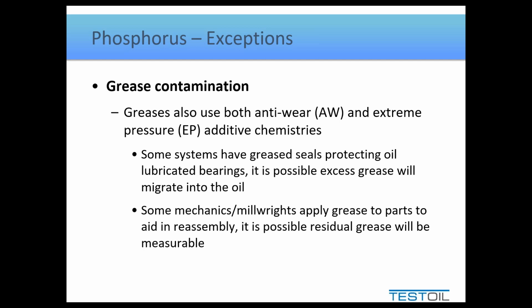Another time, though, is sometimes during assembly, whether that's from original assembly or a rebuild, that the mechanic or the millwright might apply grease to some of the parts to either help hold them in place or lubricate them on their way in. And again, that may wash off and end up in the oil. So there we go, a quick brief overview of elemental spectroscopy and a couple of elements that are going to come up in a second. But the next test I'd like to quickly review is particle counting.